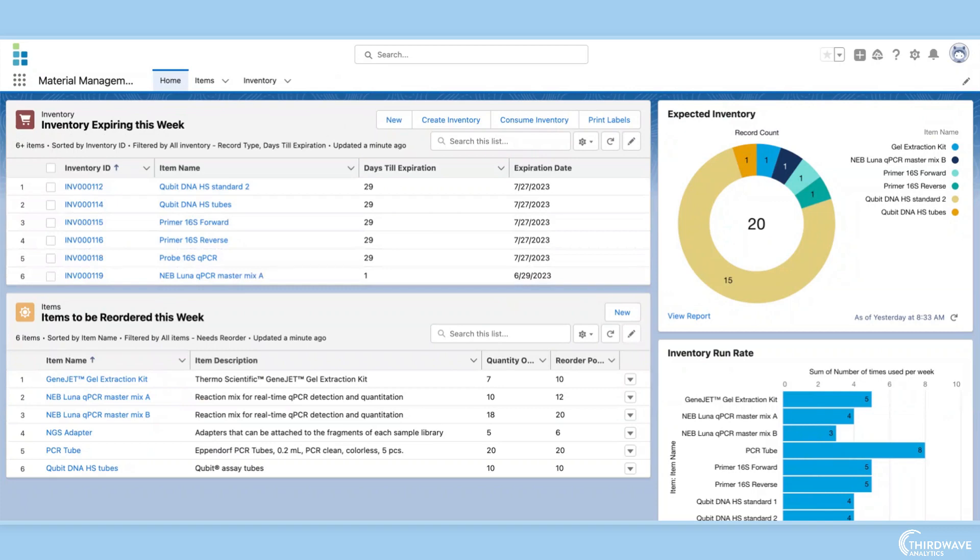Lockbox LIMS material management module helps automate a lab's inventory processes from creation through consumption. In this demo, we will explore how Lockbox can improve any lab's material management and ordering systems by tracking inventory creation, consumption, and expiration.